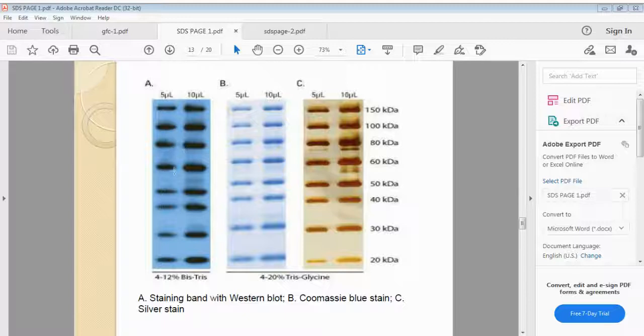So this is sustained, or you can say the detection of the protein is done by ELISA method with the western blotting, where western blotting is used to detect the proteins, whereas southern blotting is used to detect the nucleic acids. Okay, so this is the actual gel. This is not the gel. This is the nitrocellulose membrane. Okay, so this is a Coomassie brilliant blue.